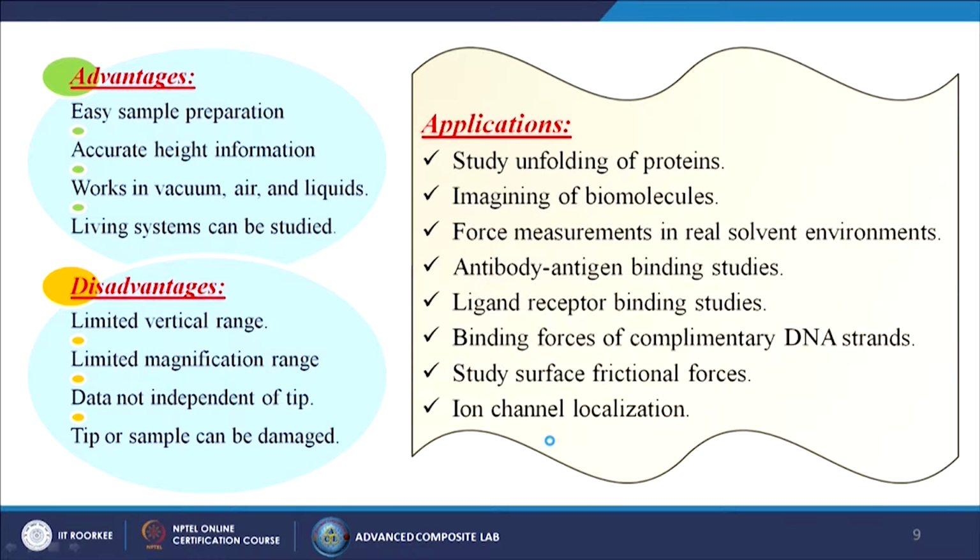What are the advantages? Easy sample preparation, accurate height information, works in vacuum, air and liquids, and living systems can be studied. What are the disadvantages? Limited vertical range, limited magnification range, data not independent of the tip, and the tip or sample can be damaged.